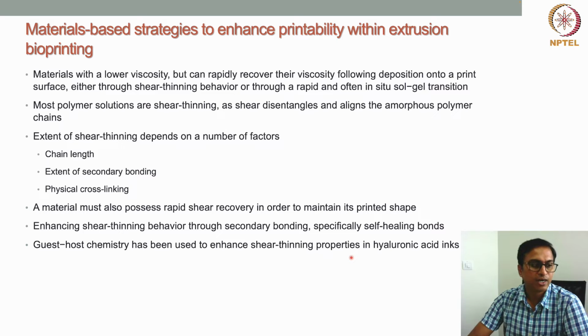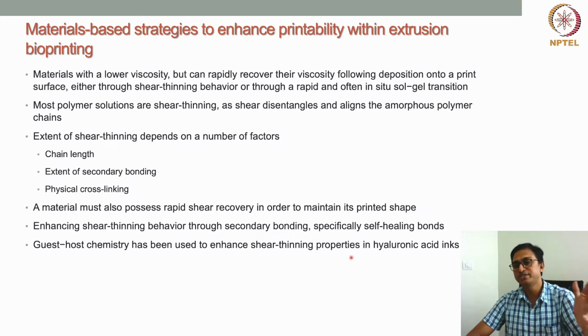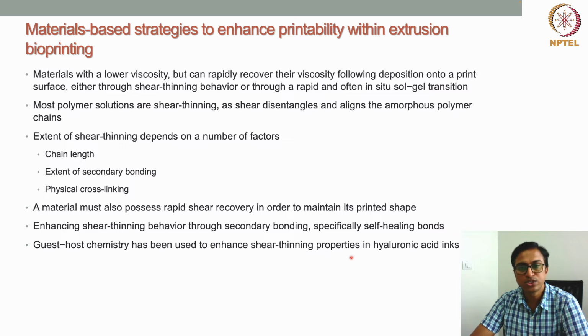But for cell culture, the cell thrives in a low viscous, open porous network environment. For bioprinting, there are two opposing requirements here. For extrusion based bioprinting, the material requirement is that it should be highly viscous, a stiffer material is required. But for cell viability, a less stiff, less viscous material is required.